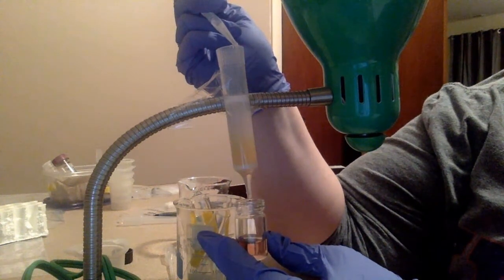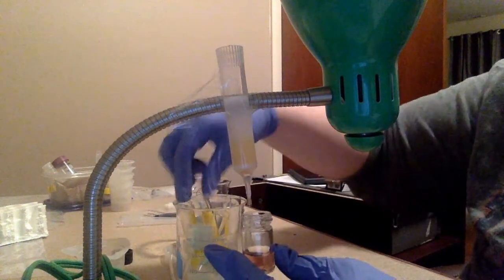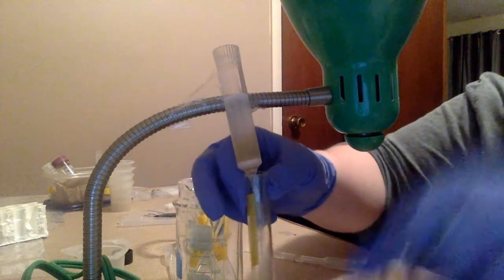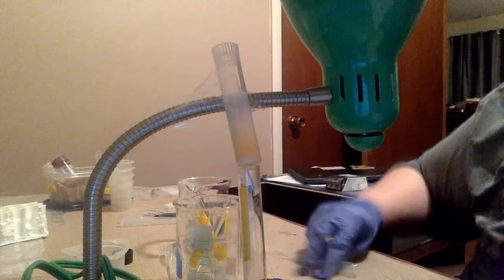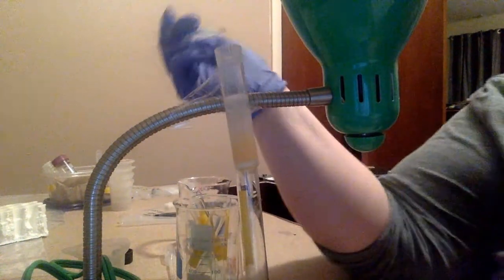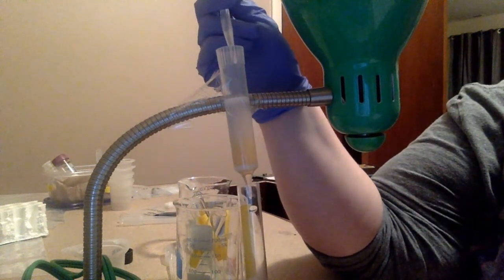So what I'm seeing here is still pink. Oh, nope. It's starting to turn yellow, so I'm going to quickly switch over there. So here is our pink liquid, and I'll show you all of them side by side in a few minutes. So that was our second color. Now our third color here is that very light yellow.